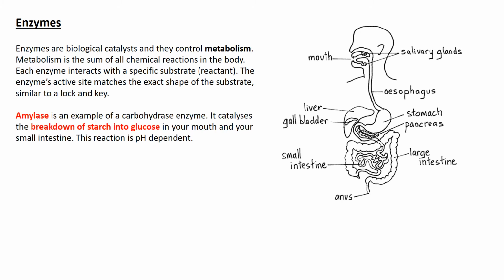So amylase is an example of a carbohydrase enzyme. They can talk about carbohydrase or amylase. It doesn't really matter which one they're talking about, but it breaks down starch into glucose.